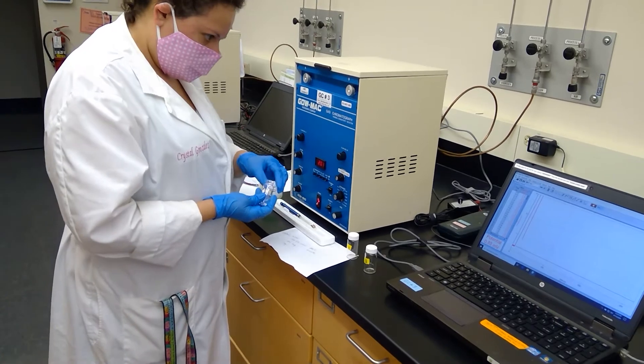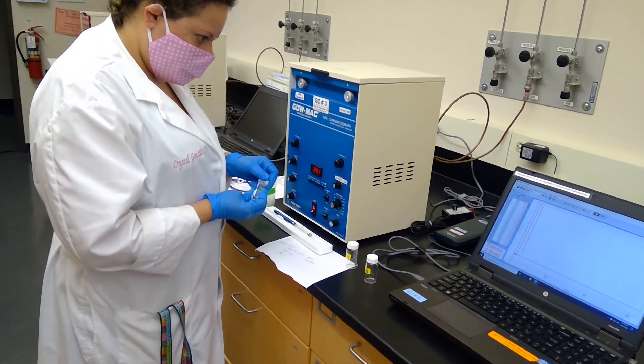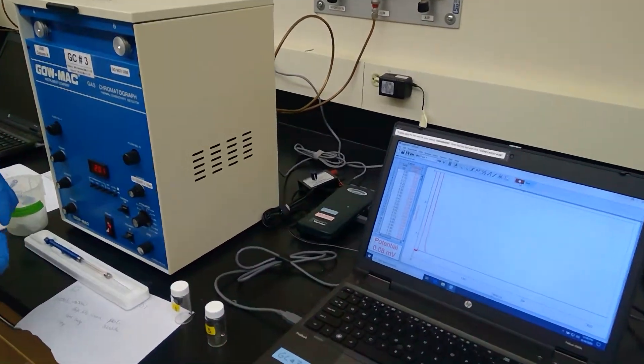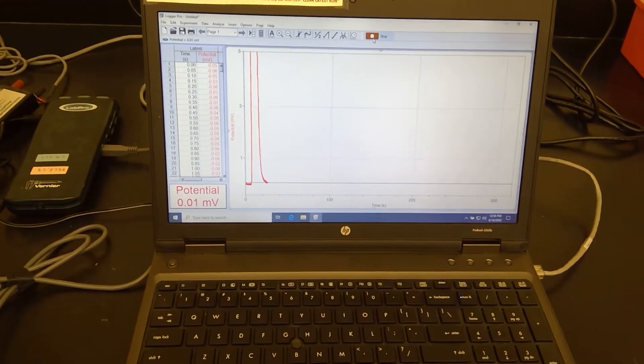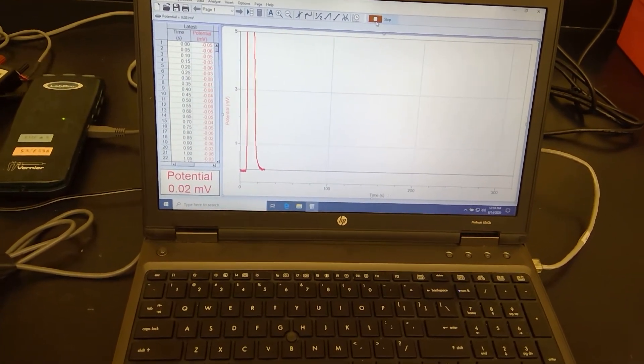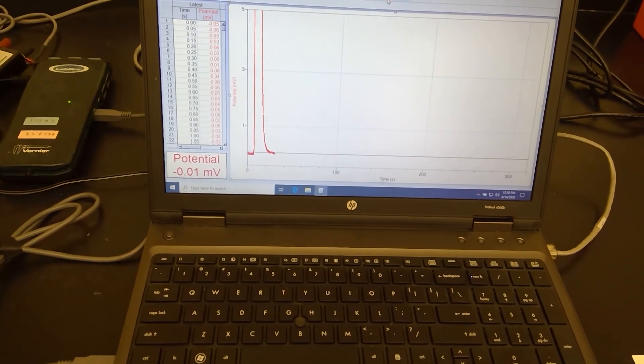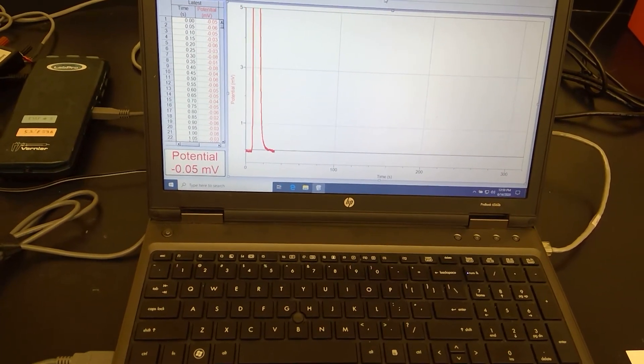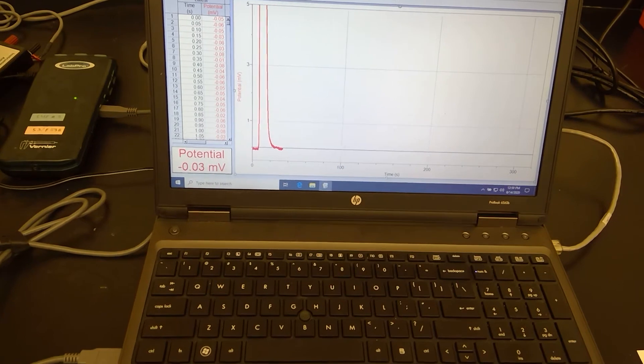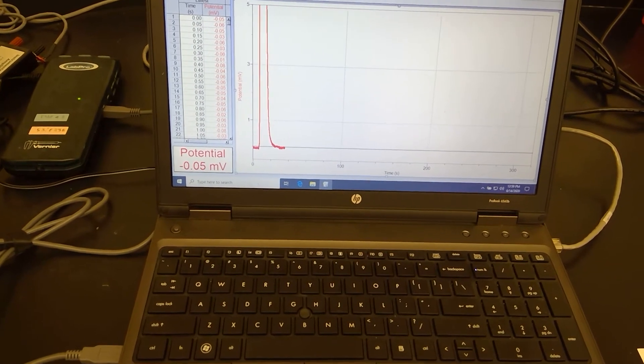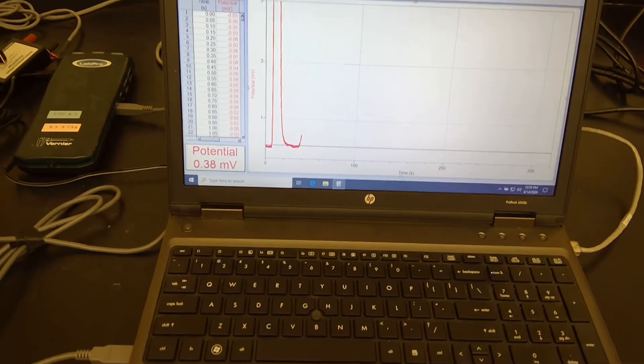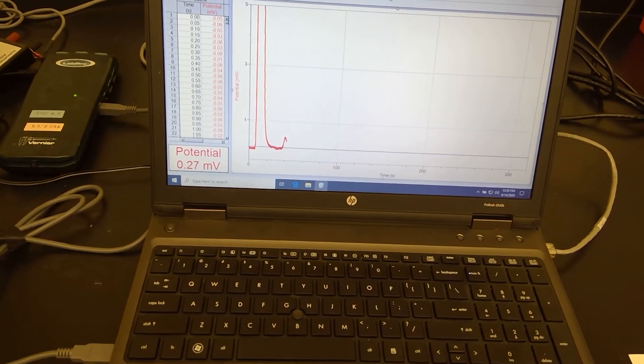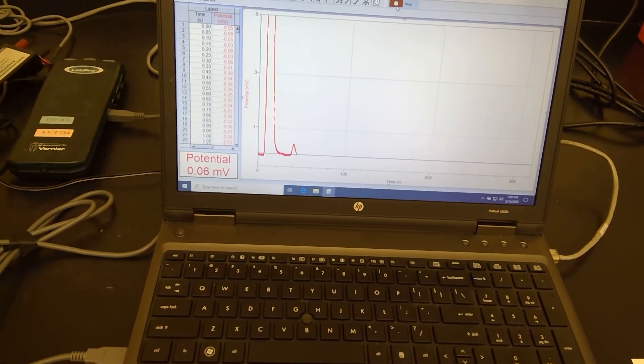So I'll have us bring our attention over to the screen. And what we see so far here is some solvent. So inside of the sample one, I had some hexanes along with our compound of interest. And so it looks like we've got a large hexanes peak. And since this is fraction one, what we're hoping to find here is a peak of limonene.